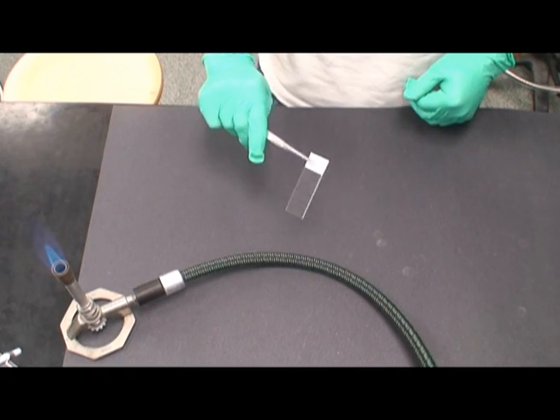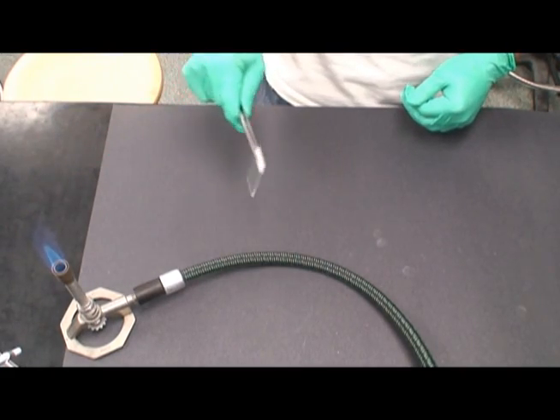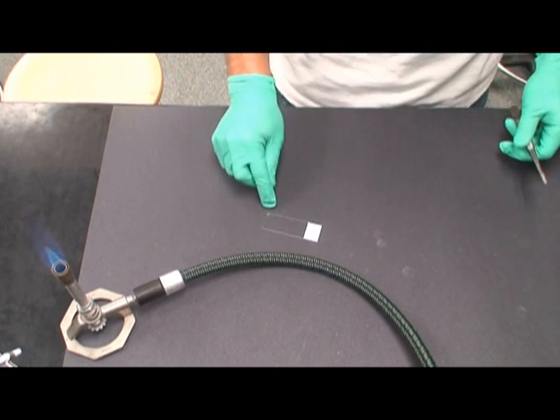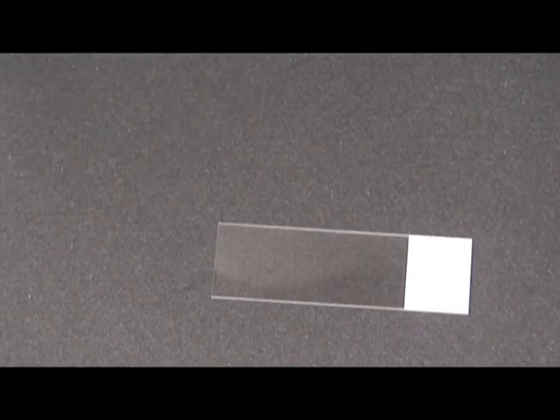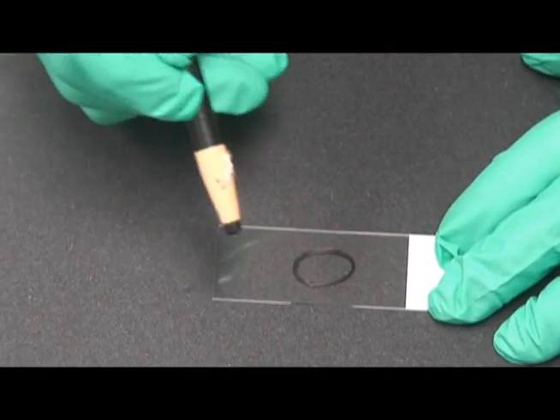The simple stain procedure begins by passing a clean microscope slide through a flame face down to sterilize it. A small wax circle is then drawn on the sterilized side of the slide to identify the location of the bacteria.